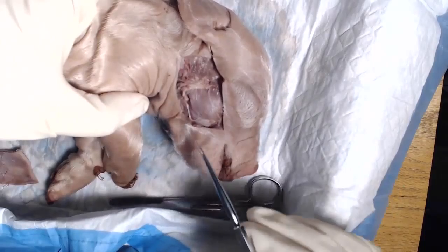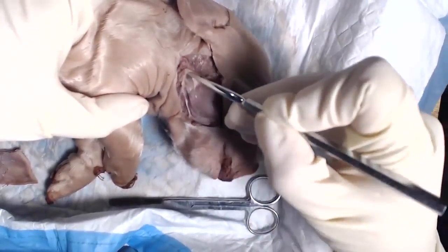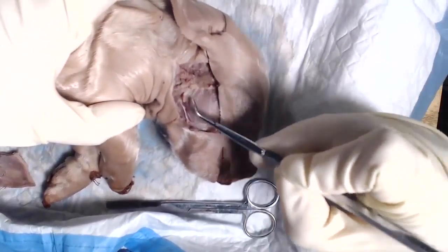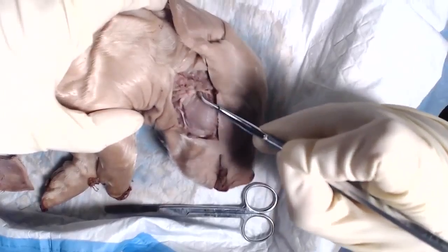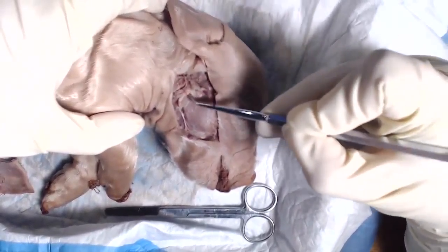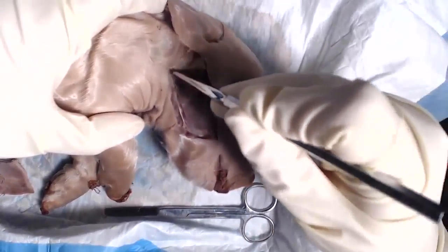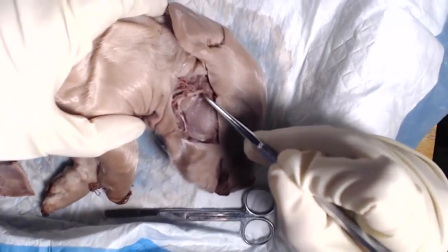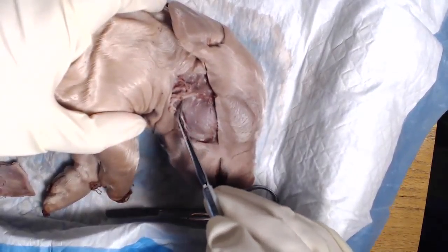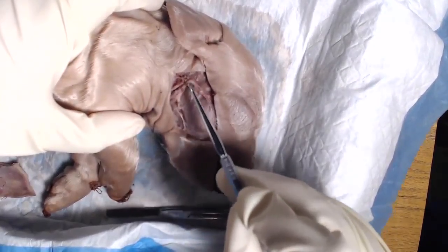So now that we've identified the parotid and the tissue on top of the masseter, we want to pull this away. Try to reflect your parotid gland away from your masseter, like this. Just underneath your parotid and right behind your masseter again, you should see a more solid spongy looking structure.